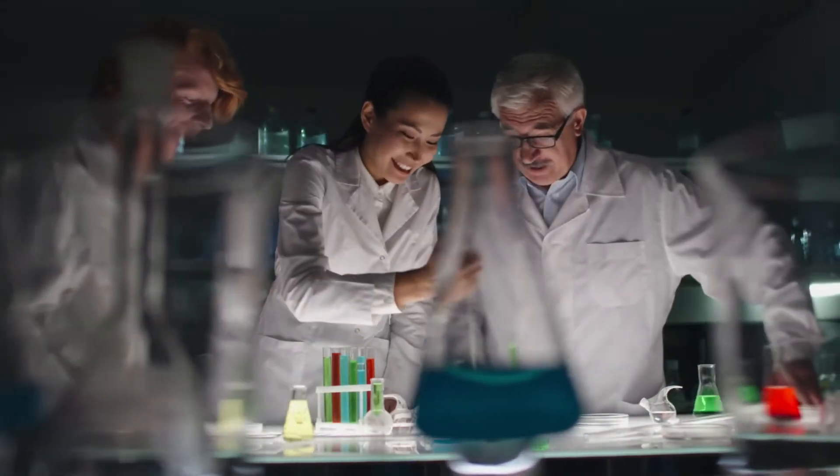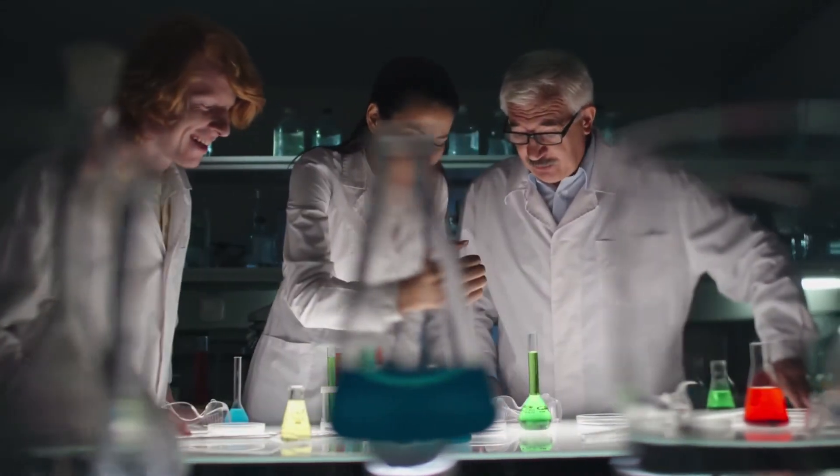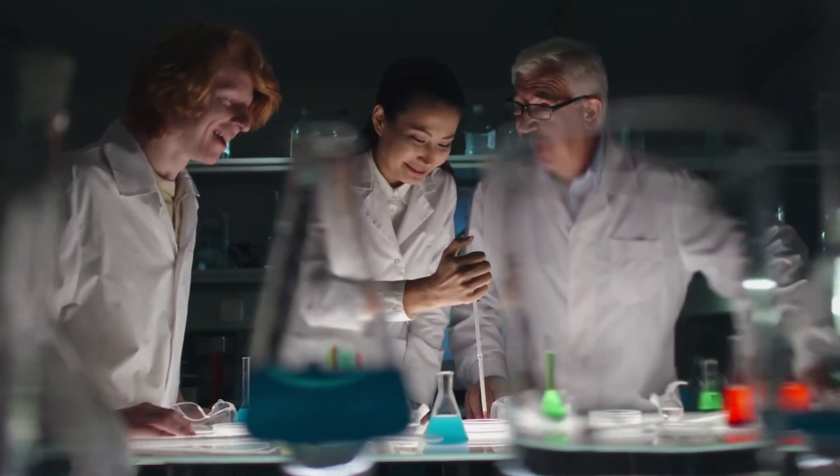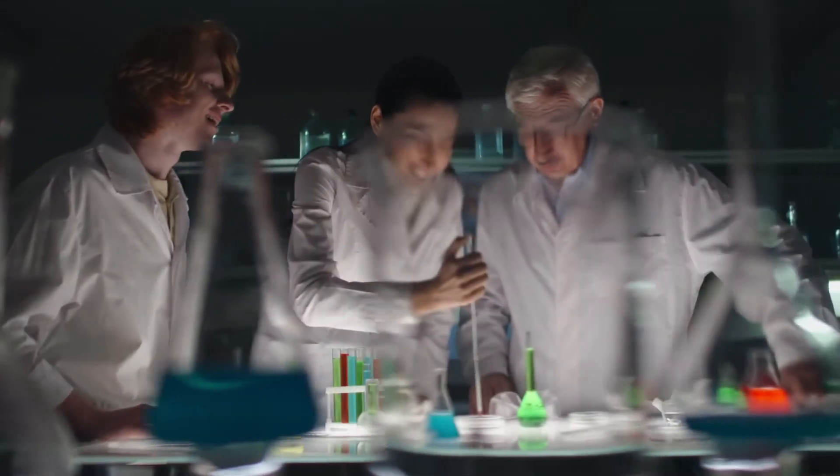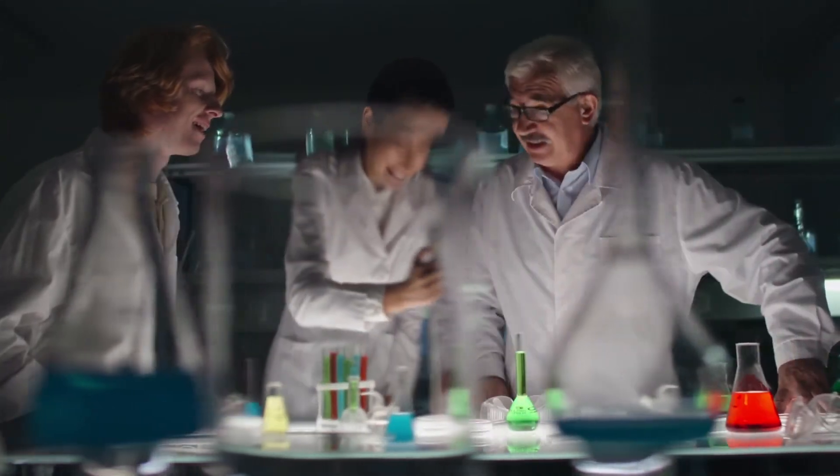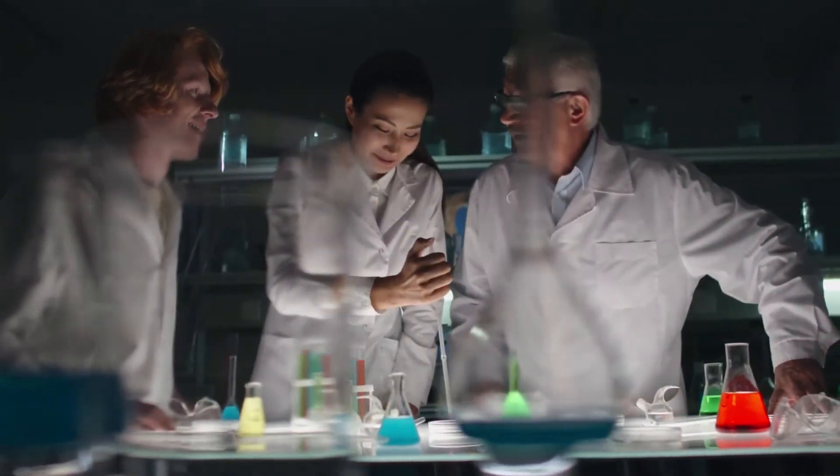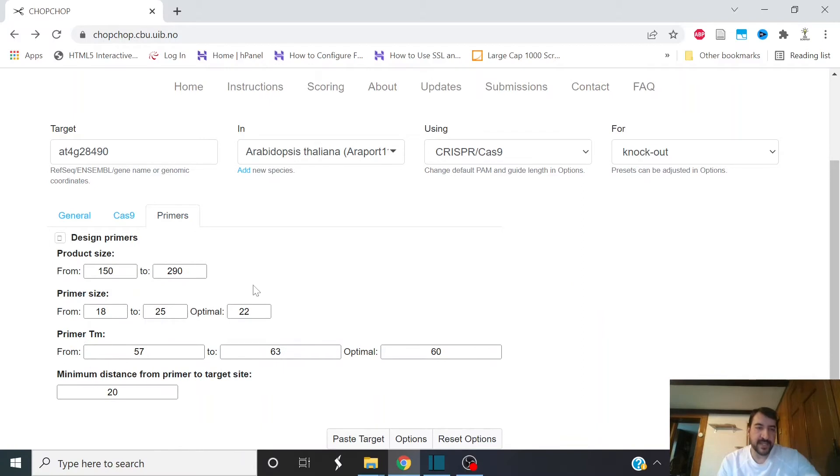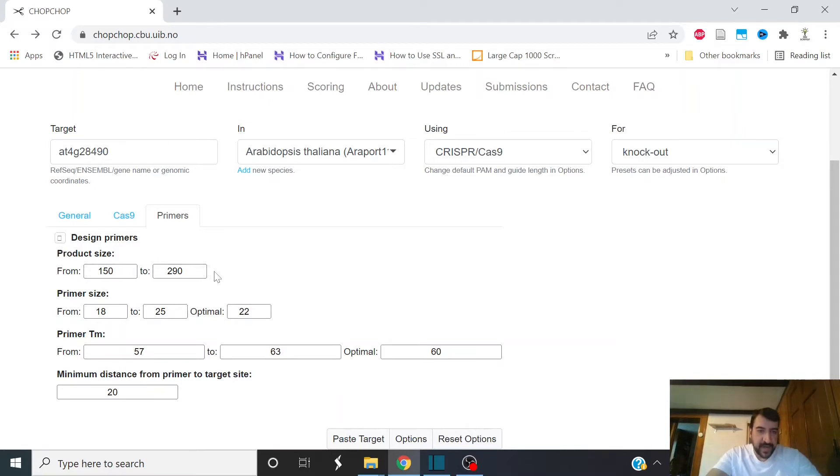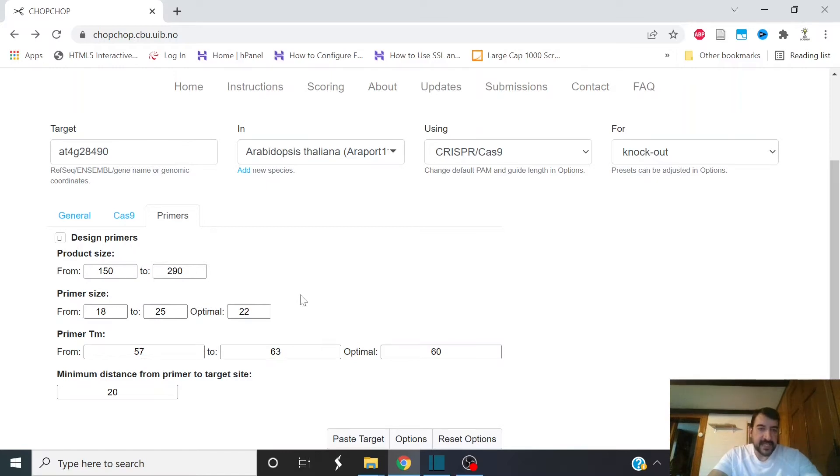Higher Cas9 cutting efficiency means more successful experiments and a happier time in the lab. There's also a primer tab under the options. ChopChop will automatically design primers for you to analyze your mutations from CRISPR. You can design the product size, the primer size, and the melting temperatures of the primers for analyzing your mutations.